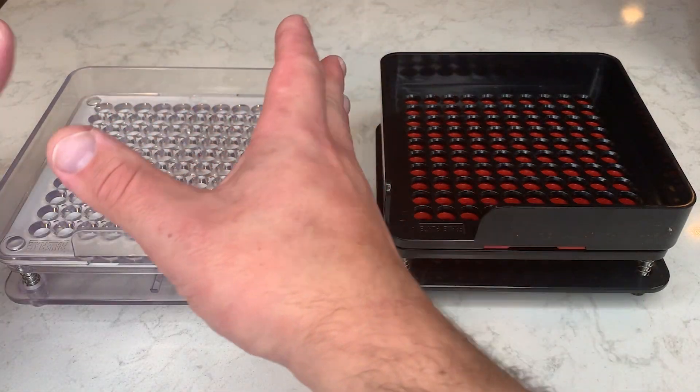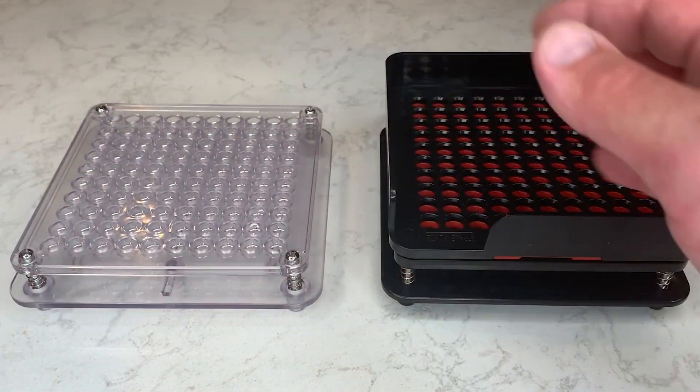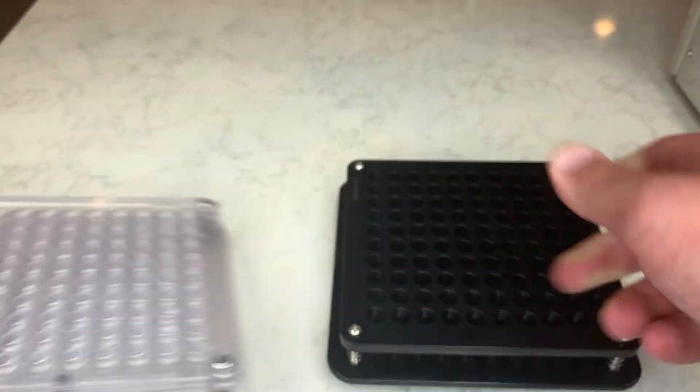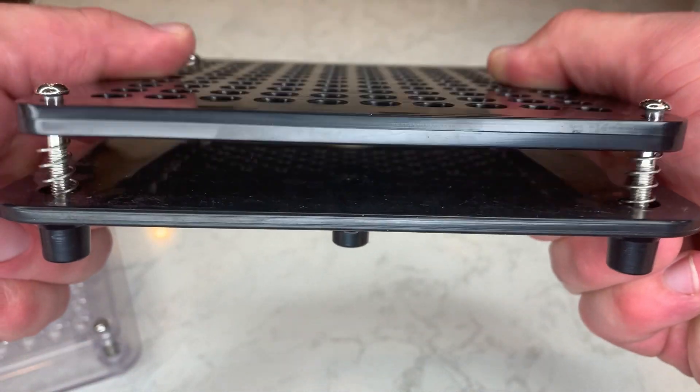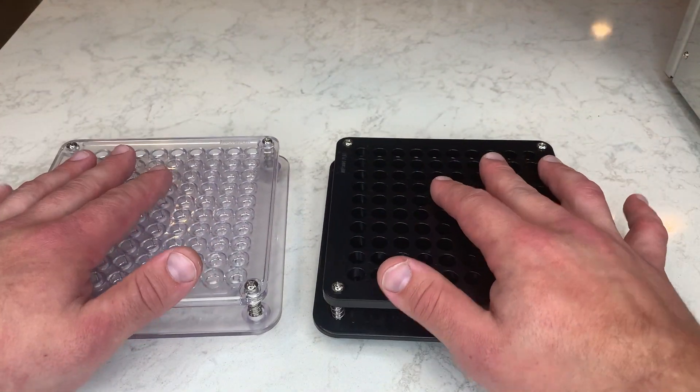There's another advantage that the transparent BladeCo machine has over the standard color one. I'm going to show you by pressing it down so you can kind of hear. Just a little bit of a smoother spring, so it makes for an easier press.